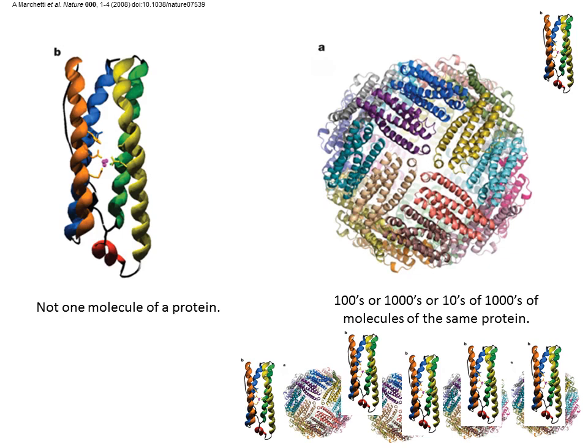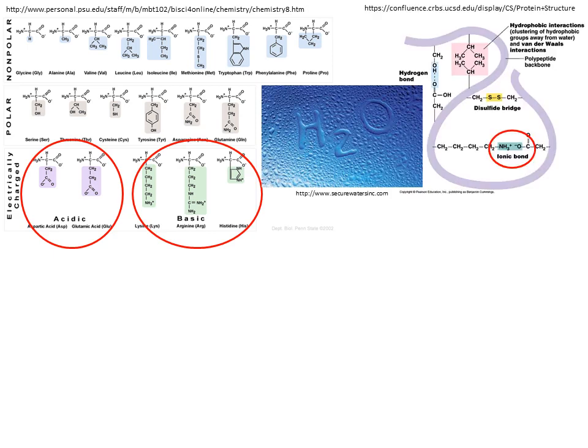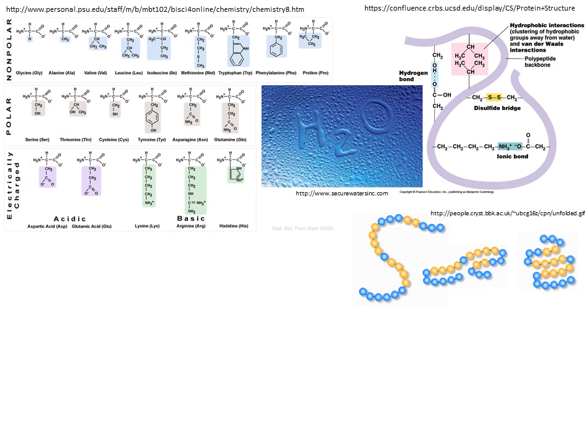All of the molecules of the same protein isoform are chemically identical, and thus they all stay together during fractionation and analysis. The majority of organisms that exist are mainly made up of water, and all biological molecules have to interact with water molecules. The 20 different amino acids that make up proteins interact with water in different ways. Some have ionic interactions like the acidic and basic amino acids. Some form hydrogen bonds, while others are hydrophobic and would rather associate with other hydrophobic molecules within the protein and without than interact with water.